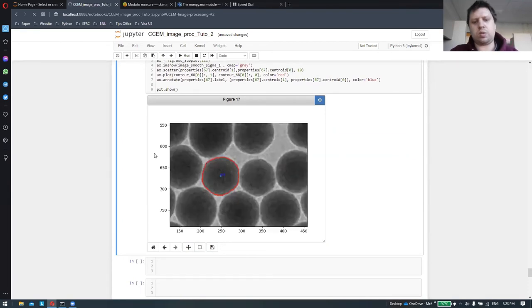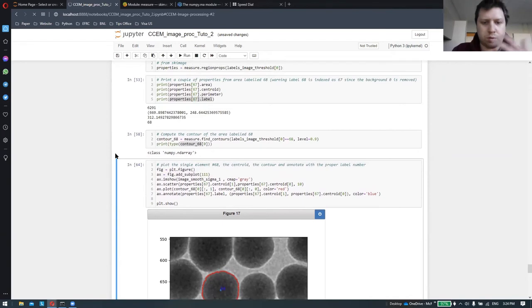So the good point here is that you are providing a certain methodology to map this contour. You could do it manually, you could do it using any other type of software, and even do it by hand. But here you have a kind of criteria that you decided, and you can afterwards even show how this contour has been mapped. So you have this function here.